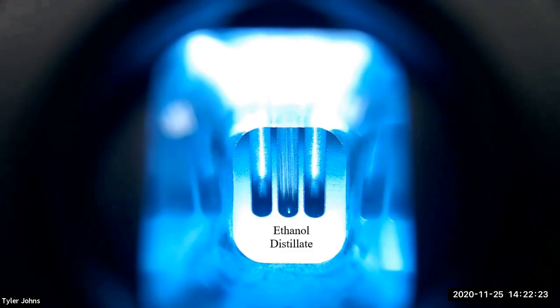We will now perform a microscale boiling point determination of the ethanol distillate.